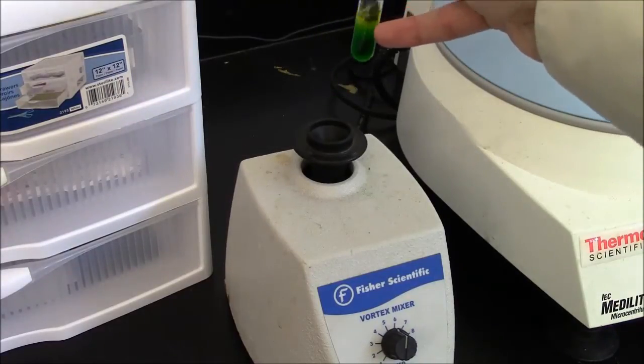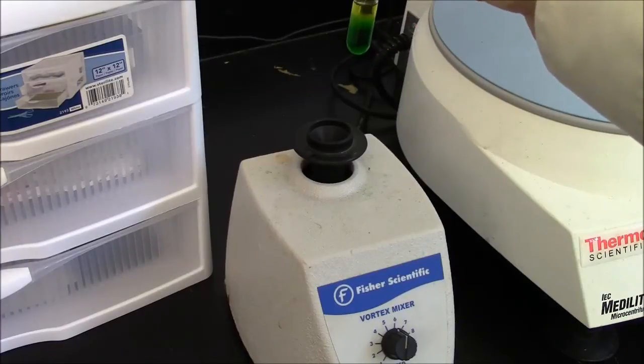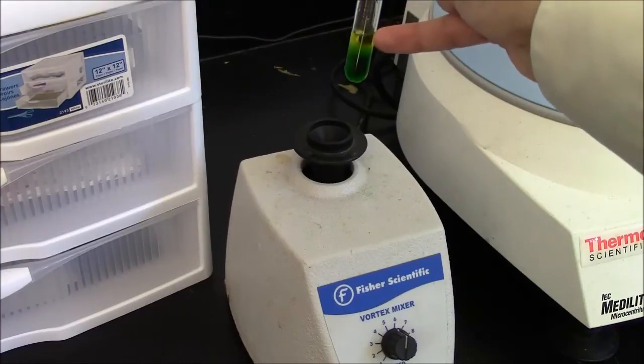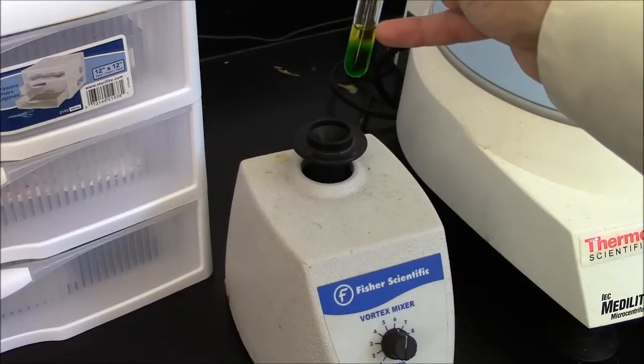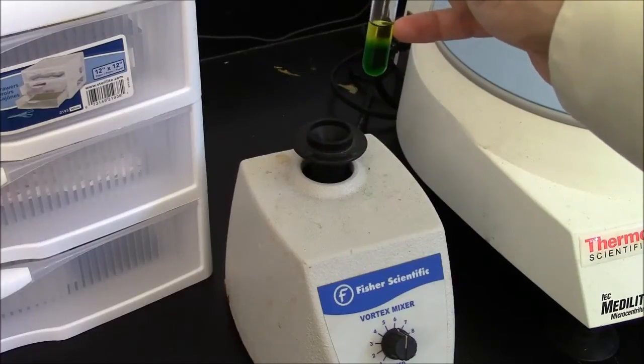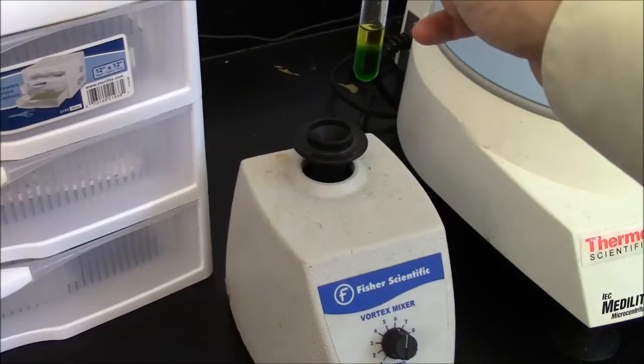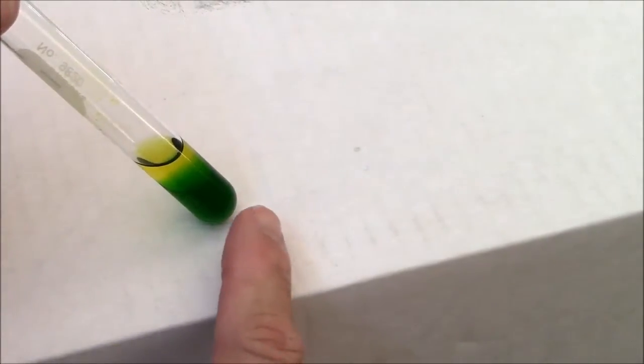So now I'm letting my layers separate. You can see a little bit of color is being extracted into the organic layer. Most of the color is remaining in the aqueous layer. Here's a close-up of what I've got. More of a yellow color in the organic layer, and the dark green is remaining in the aqueous layer.